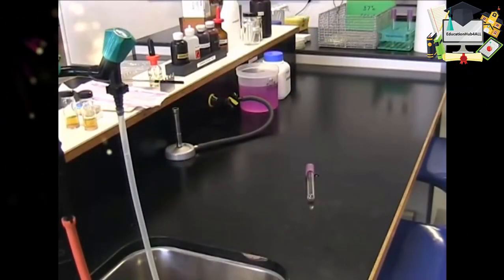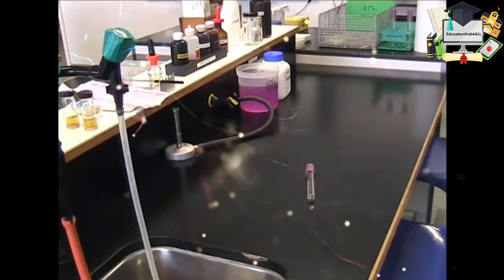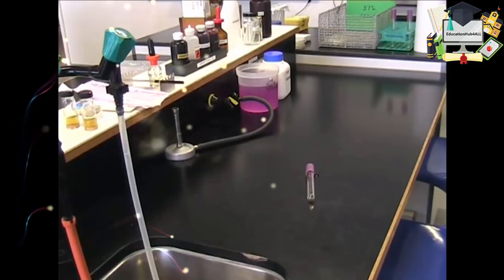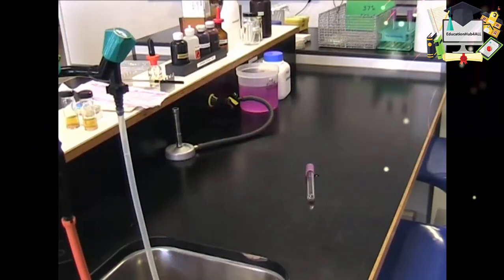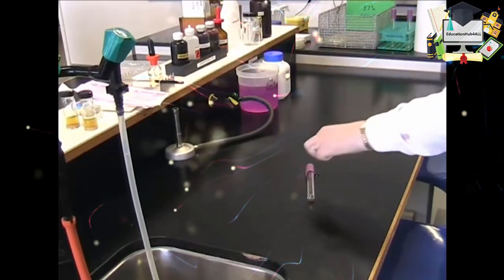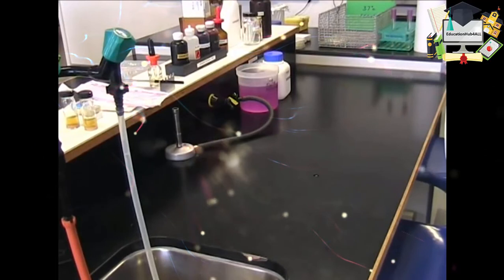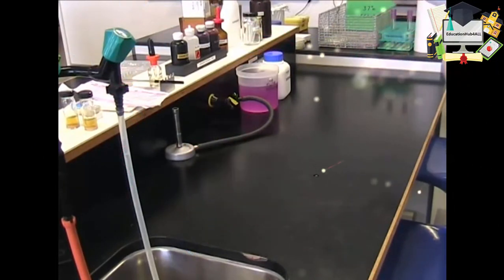If you have a spillage of contaminated material in the lab, it's very important that you let someone know so that it can be cleared up in the correct manner. We can see here that someone has laid their test tube flat and the liquid has leaked out onto the bench. So make sure we remove the test tube into the discard tin, and then we're going to deal with the spill left behind.